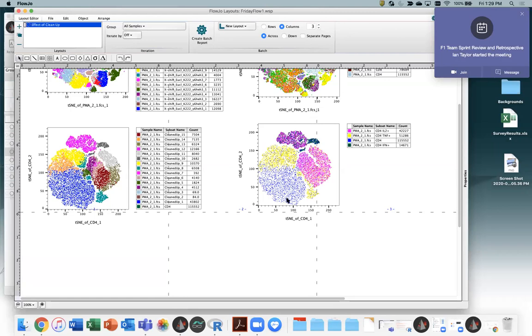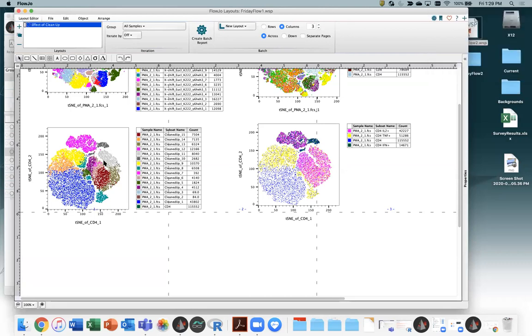If we look at my manual comparison, I said, well, those are IL-2 positive CD4s, maybe there's something more going on here. Maybe the combination of parameters indicates that that is a different cell type. And maybe there is some subset here of these tan ones that is worth looking at. And then we can see also the things that I called CD4 just TNF positive, which seem to stretch into a second population here that maybe I didn't consider when I was gating, do get separated by Phenograph. So again, just a handful of pictures to say cleanup was worthwhile, and this is how one might see those differences manifested when looking at the data.